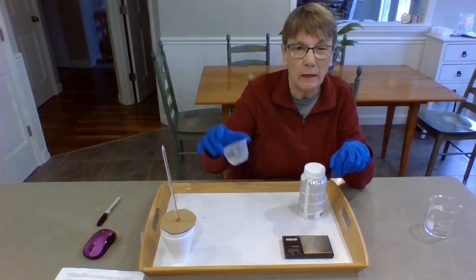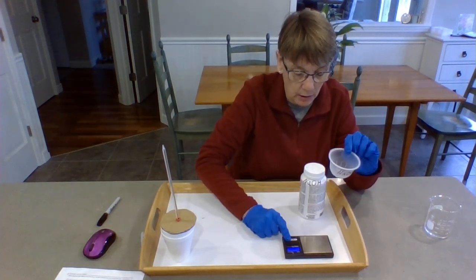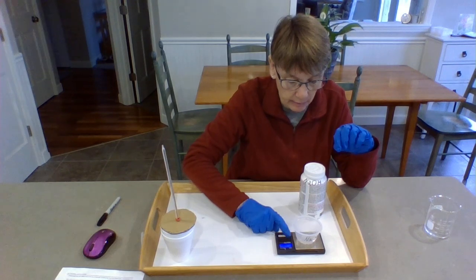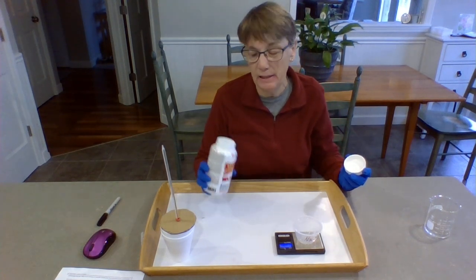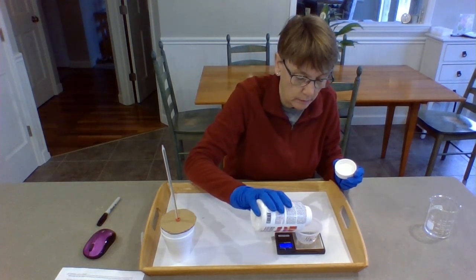So I'm going to put this little cup on here, turn on my scale, put this on and then tare it. Okay, and I'm going to put in 2.5 to 3.0 grams. Again, it doesn't need to be any exact number as long as it's in that range.